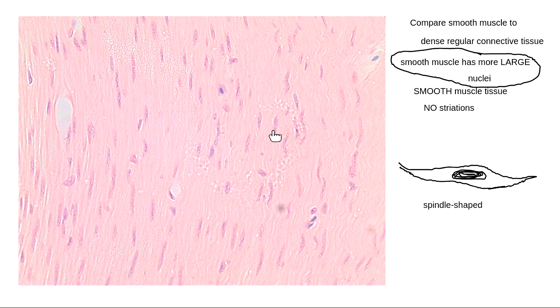Okay, perfect. Yes, so Nicole says that dense, regular connective tissue is on page 20 of that online guided lesson. So if you wanted to pull that up, to put it side by side with the smooth muscle, that would be a great way for you to practice, to see those two. I think I put in another image of this. Yeah, so one more image to show you.